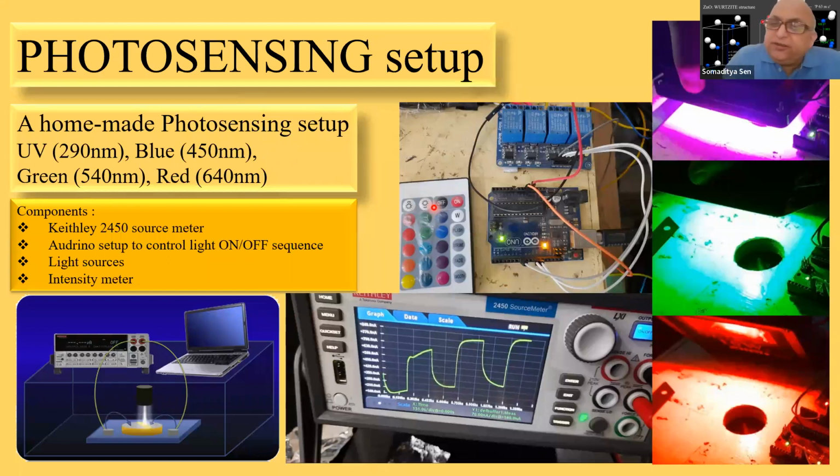Now, what are the functionalities that we can watch? In the beginning of the slides, I showed some data on the photosensing. Now, the photosensing is a very interesting thing. This is a homemade setup that we developed in our lab. It's a very simple setup.